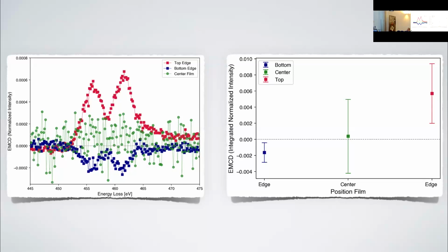Is there a way to escape from this kind of measurement? If I had a temperature gradient and I measure at the top and the bottom, I would get the opposite effect. But you will have an opposite temperature gradient because the temperature will dissipate towards the edges, so the gradient will be up and down. The temperature gradient will be along the x-axis, not along the y-axis. It will be along the y-axis.